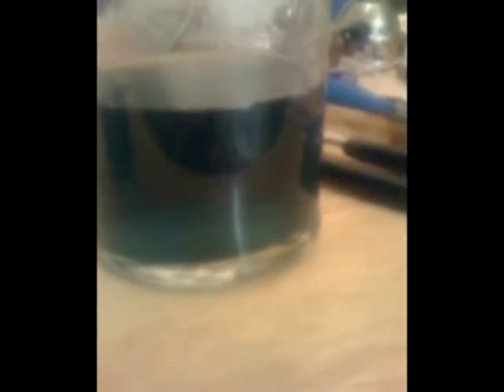Okay, I'm draining off that particulate matter in our fluid, and as you can see, there's still quite a bit of copper. This will be mostly clear, certainly devoid of any blue or green color, when it's completely finished. So I'm going to finish draining this, and then I'm going to start the electrolysis again.